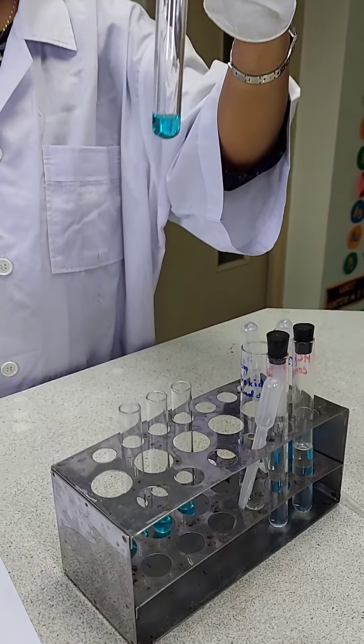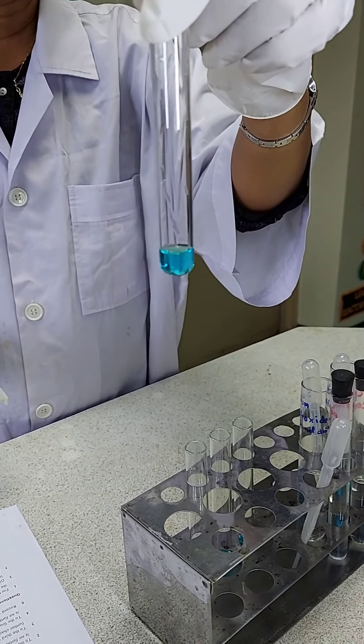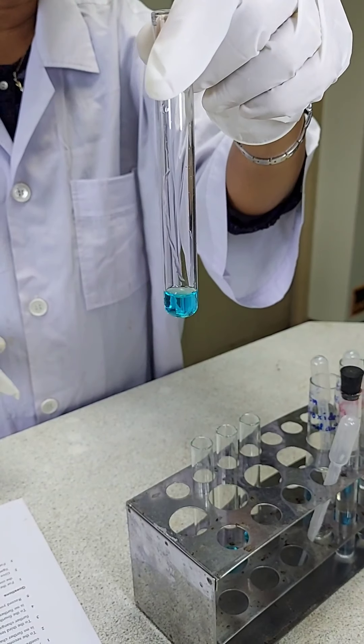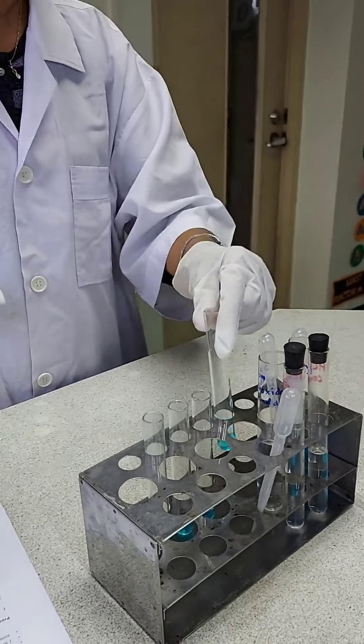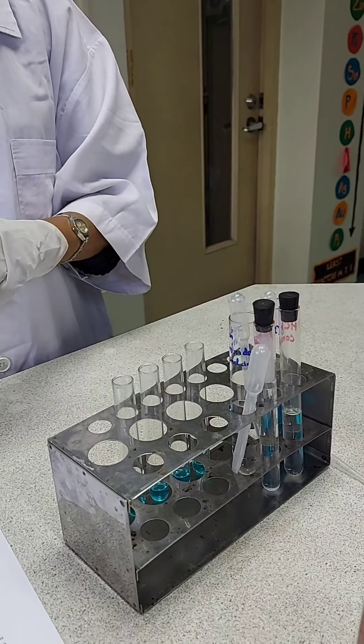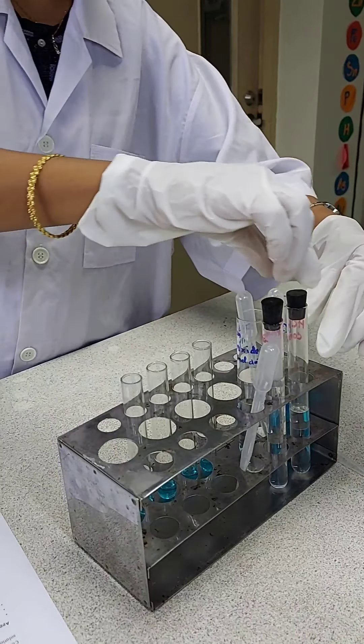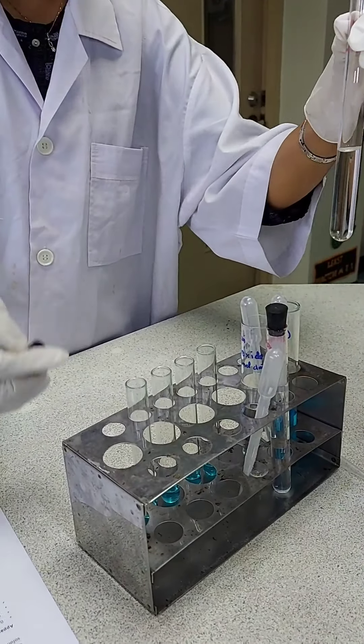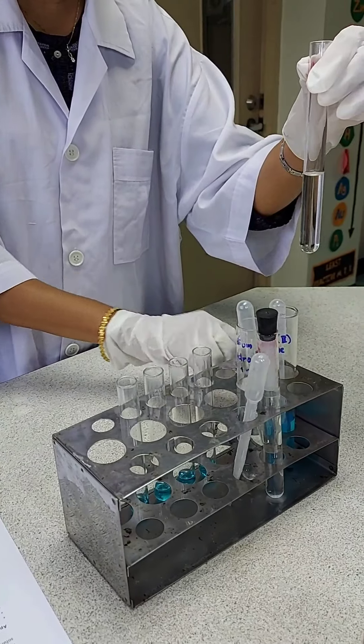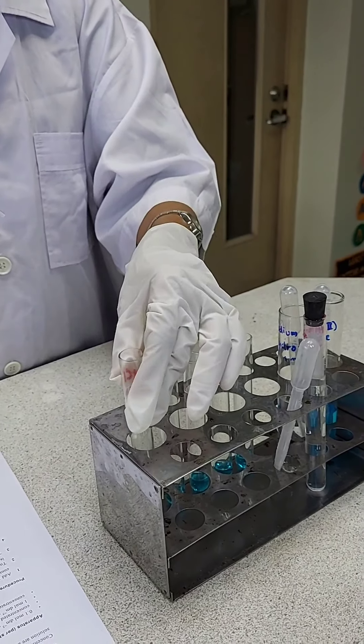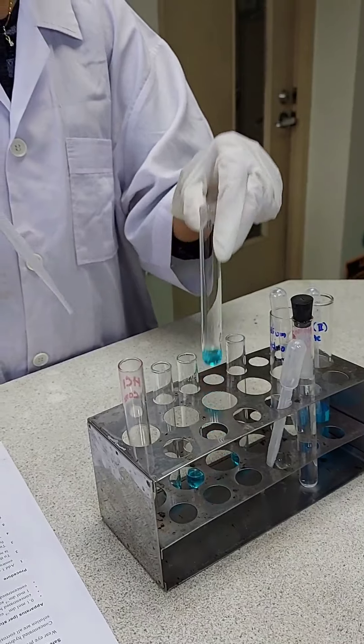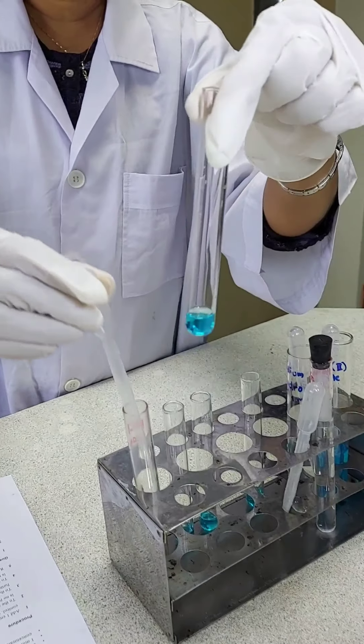The first test tube we'll keep as a control. We'll add the concentrated hydrochloric acid drop by drop into the second test tube till there is no change in color. Make close observation here.